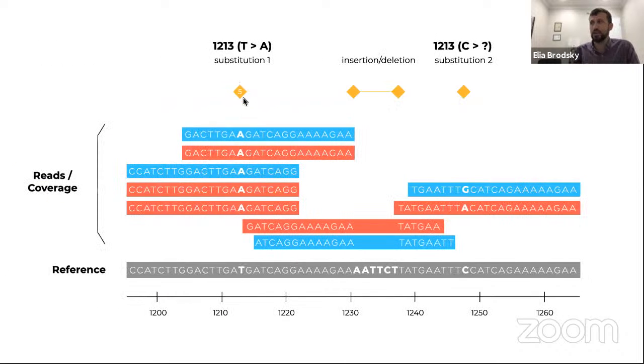For example, here you can see a change in this position. We have 1, 2, 3, 4, 5 changes. We don't have any other data that will indicate otherwise. Well, I wouldn't say that this is a new virus. This is some kind of variant that emerges, because most of the information is the same, right?